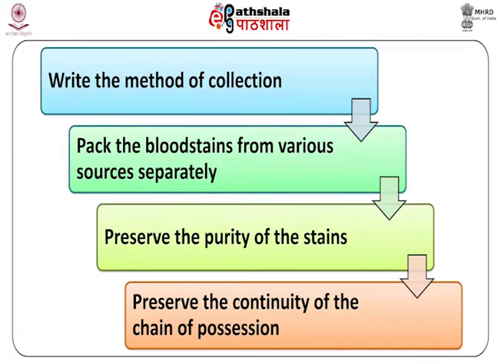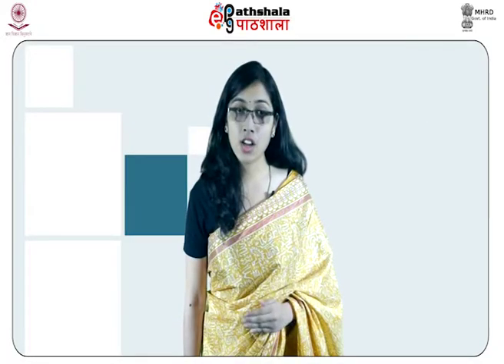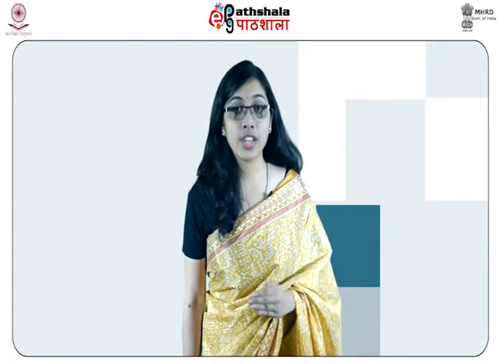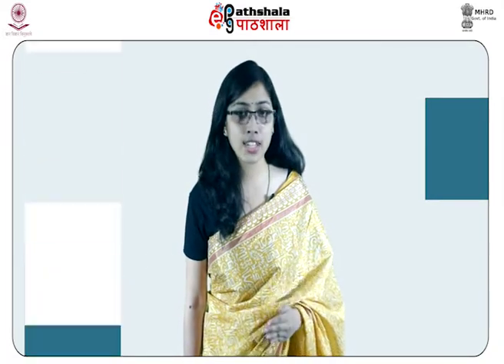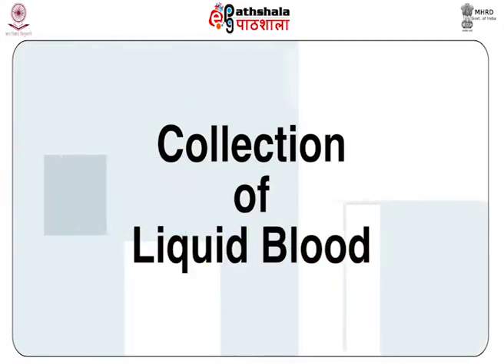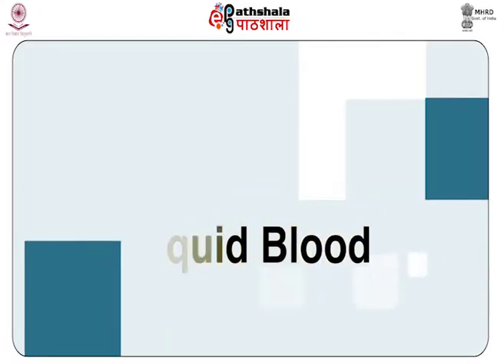The possession of the evidence should be accounted for from the time of recovery to the time of its production in the court. Method of collection of the blood evidences vary with the nature of the evidence and the place or the article on which it is found. Now we will study about the collection of liquid blood samples.